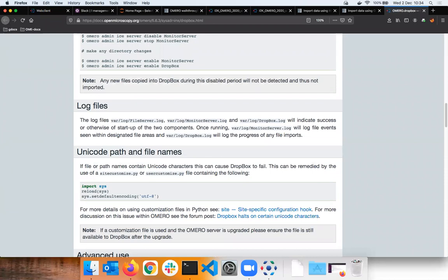Somebody like that must make the information and the knowledge flow, and the communication must be there inside your institution. But it will not be a magic out of the box solution for everybody, like Imaris has. It's not the case. You have to do something on the server, but everything is possible. Okay, I will look at that Dropbox.